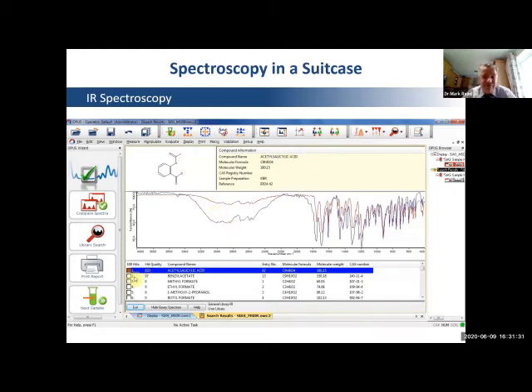It's identified the compound as acetyl salicylic acid, or simply aspirin, and at the bottom it's compared our spectra with its reference sample. It also shows a goodness of fit, so how confident is it that it's found the right spectrum. But you can see this was very useful. We took a very small amount of sample, we analysed it very quickly in only 8 scans, and we very rapidly identified it from its fingerprint region, as well as all of the other peak positions and the relative peak heights in the database to come up with the compound acetyl salicylic acid.